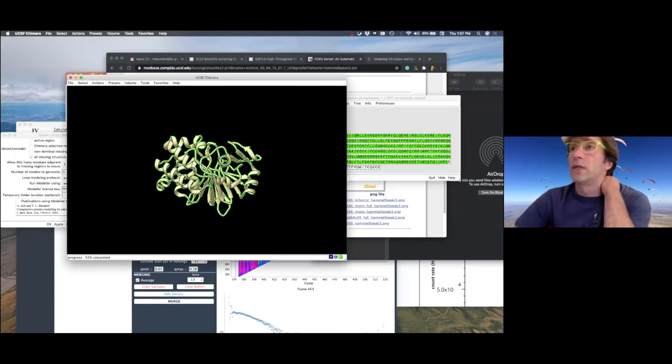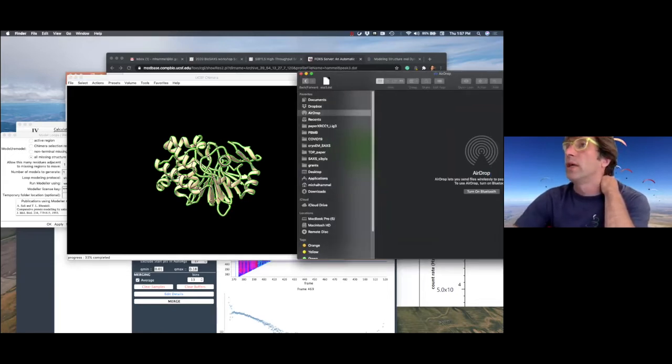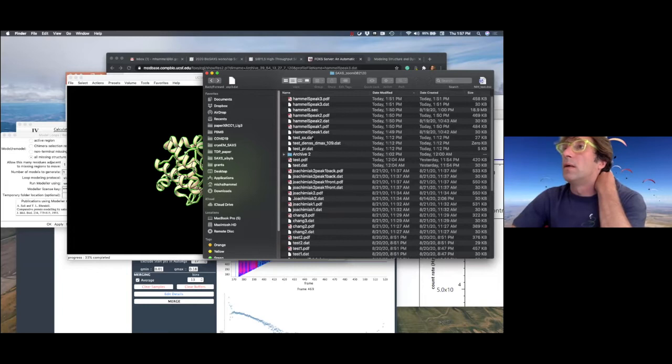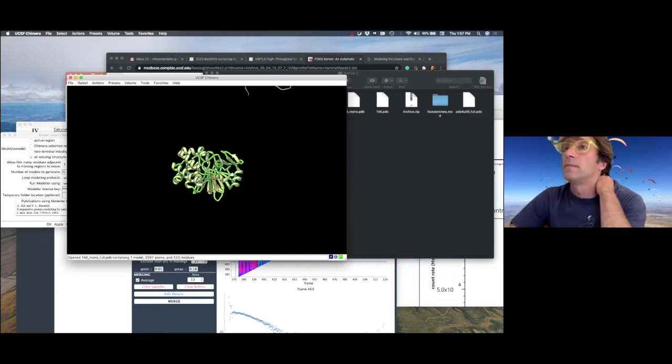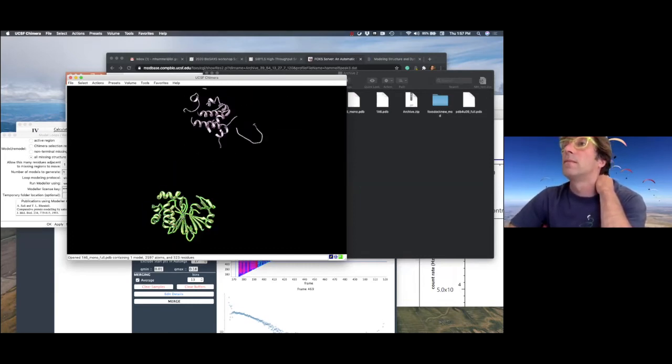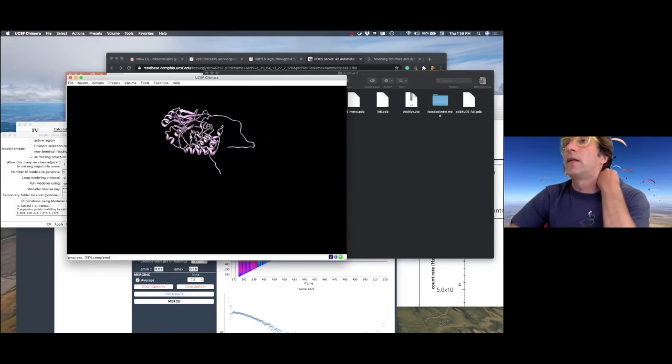And I already have it ready for you because it takes 2 or 3 minutes. We don't have the time to wait. So this is how it looks. Okay. So you see those added regions.